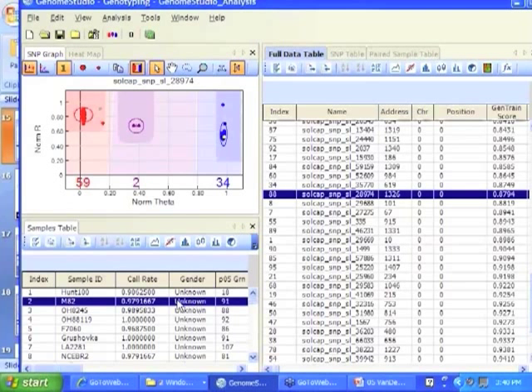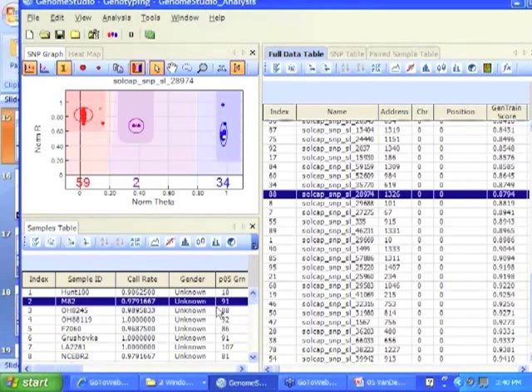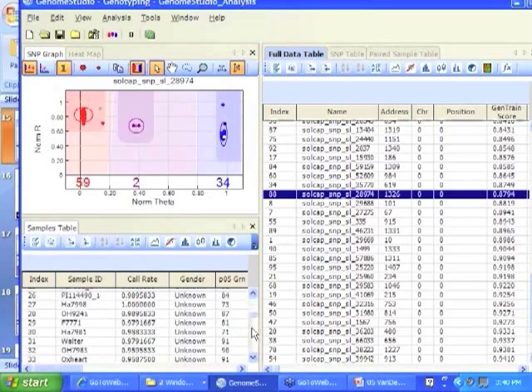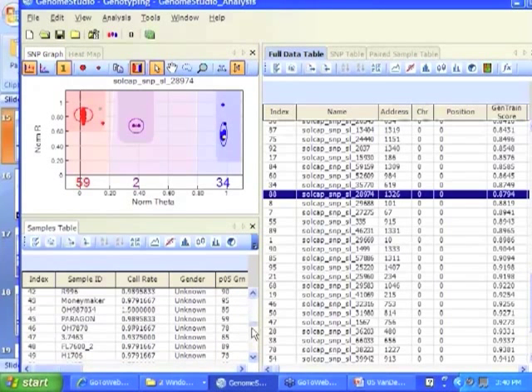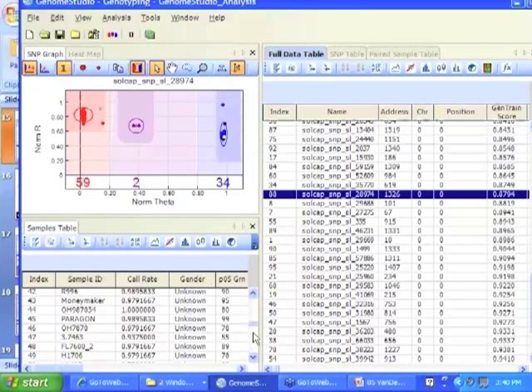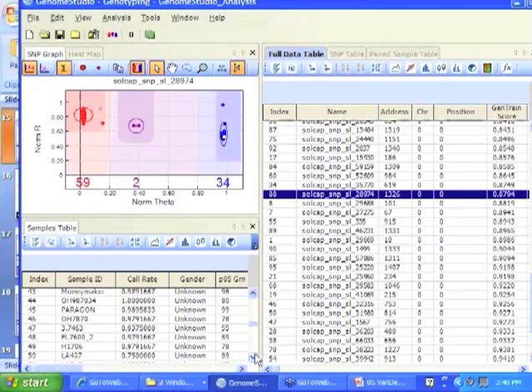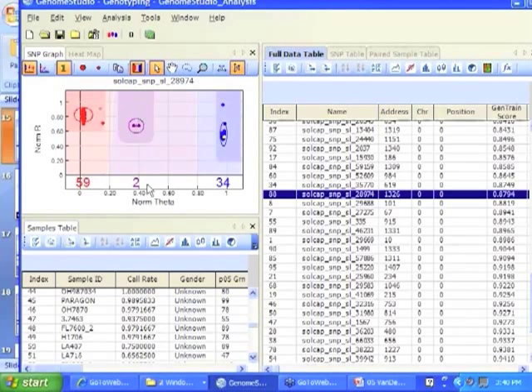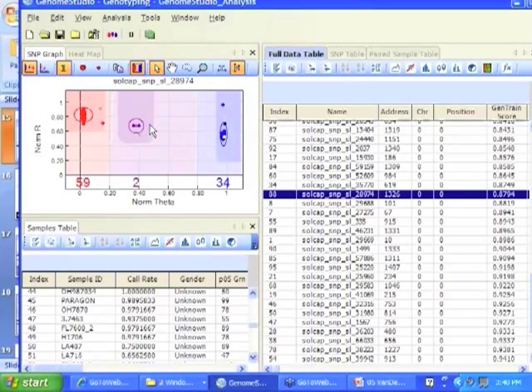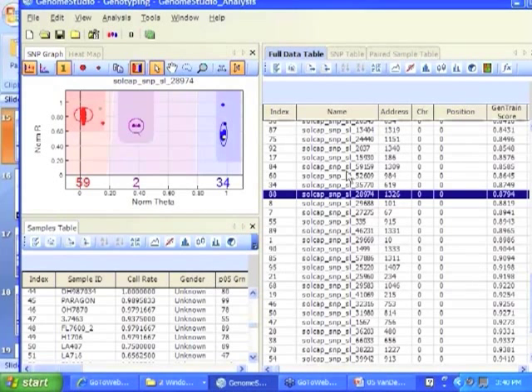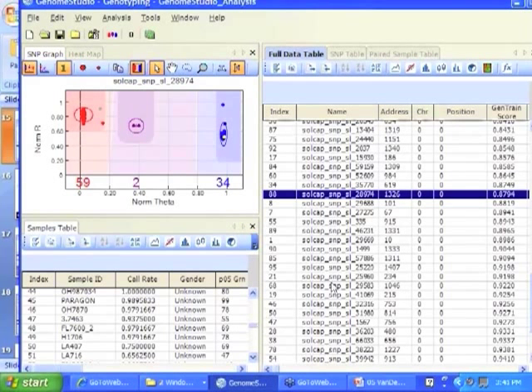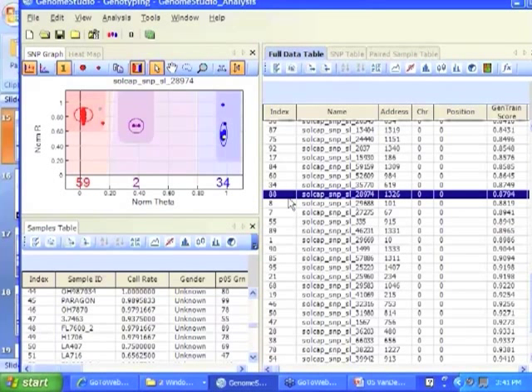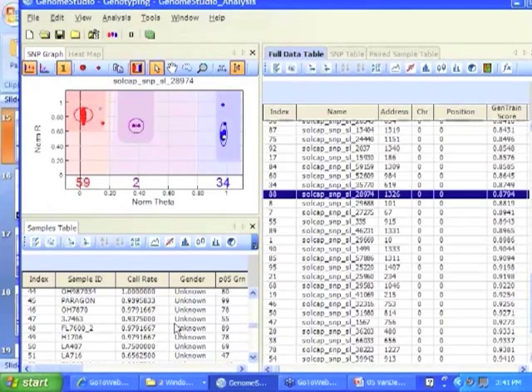And on the bottom left you have the samples so you can scroll down and you can recognize some of these names. This is just a random set of genotypes that David had picked to try to get the genotypes. And what you see here on the top left is really the display of these, the combination of these, of the data for these two windows. So what does data look like at SNP, in this case number 88, for all the samples.